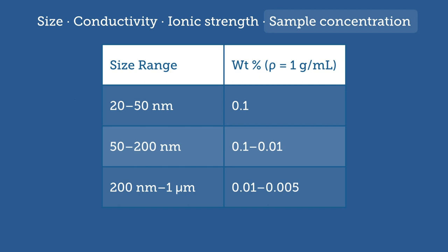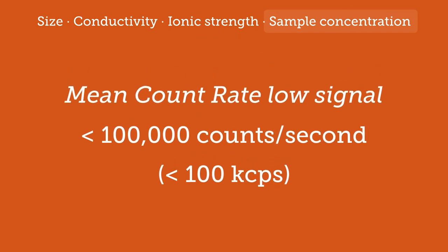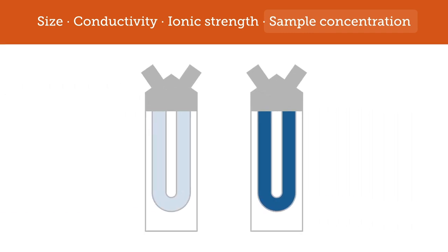When a sample has insufficient signal, the resulting measured zeta potential value is low in magnitude. Low signal is indicated by mean count rates that are below 100,000 counts per second. This can happen due to a sample that is too dilute or a sample that is overly concentrated due to a phenomenon called multiple scatter.